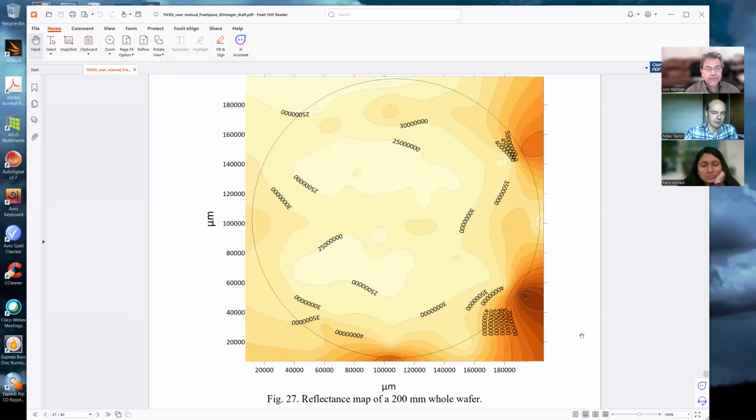On the other hand, think of another situation where we have a substrate of known resistivity on which we have another layer, called an epitaxial layer, or some other layer of different resistivity. Then an advantage of the T-ray is that not only can we measure the substrate, we can also measure both layers: measure the surface, then go deeper and measure the substrate.